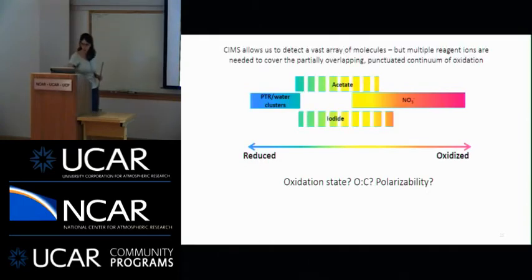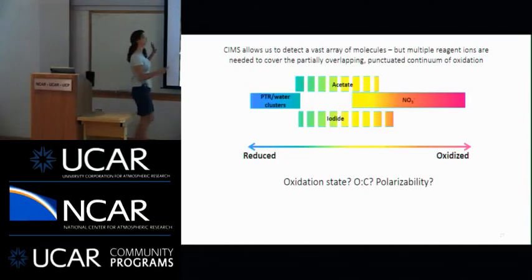However, I will point out that at least these two reagent ions that we're studying, I don't believe measure a continuum of any individual molecule. They're more like a punctuated continuum of oxidation that we measure. My point with this figure is that all of these reagent ions allow us to access different types of molecules. I did not add any punctuation on the nitrate or the PTR because those are not my measurements, and I'm not entirely comfortable with those systems, but it wouldn't surprise me if we shouldn't think of them as measuring everything.